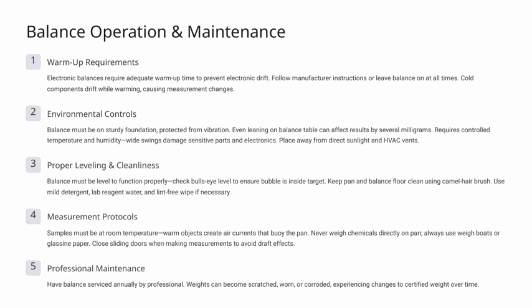Let's talk about balance operation and maintenance. First, warm-up requirements are crucial for electronic balances. They need adequate warm-up time to prevent electronic drift, which can cause measurement errors. Always follow the manufacturer's instructions, or better yet, leave the balance on all the time if possible. Remember, cold components tend to drift as they warm up, impacting accuracy.